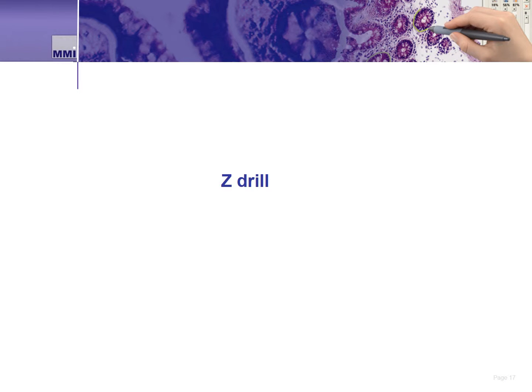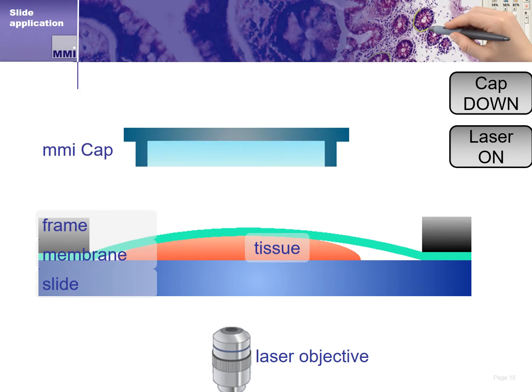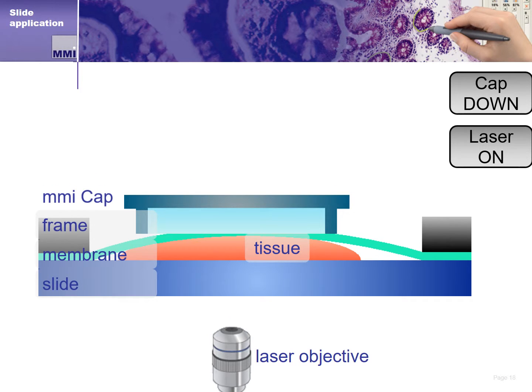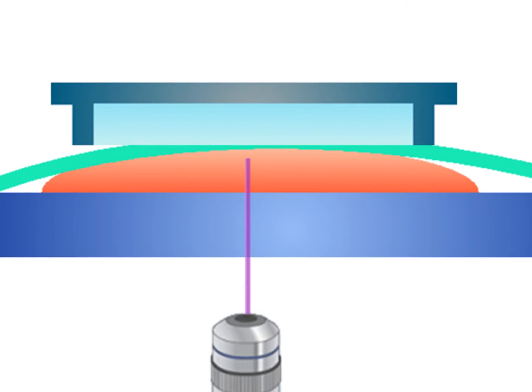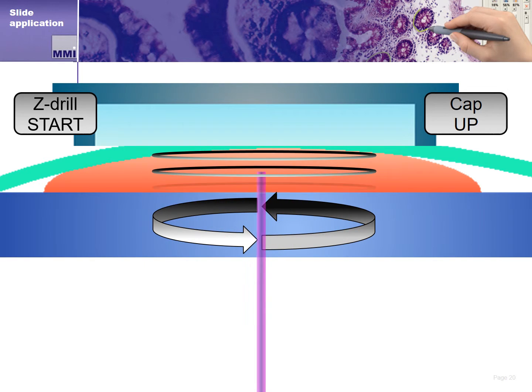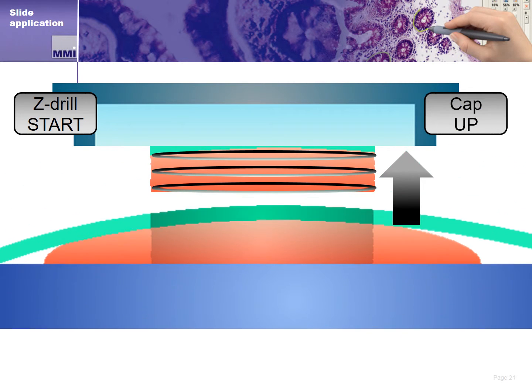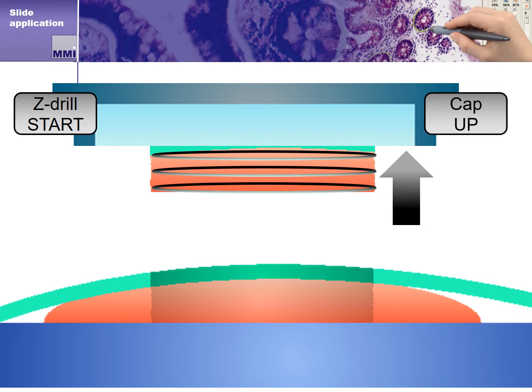Another advanced application allows end users to cut very thick samples — it is called the z-drill method. When working with sections that are very thick, perhaps 100 microns or more, the MMI CellCut's z-drill function becomes useful. The system identifies tissue in the same way we've discussed, but we now identify the thickness of the tissue and set the z-drill to cut the entire thickness of the selected region with multiple precise cuts in the same location. When all cuts are completed, the cap system lifts the thick tissue section off the membrane slide.